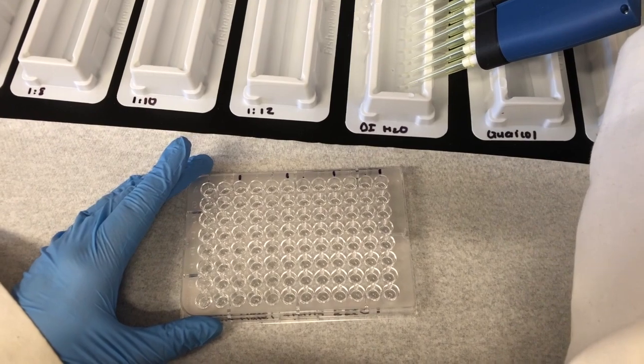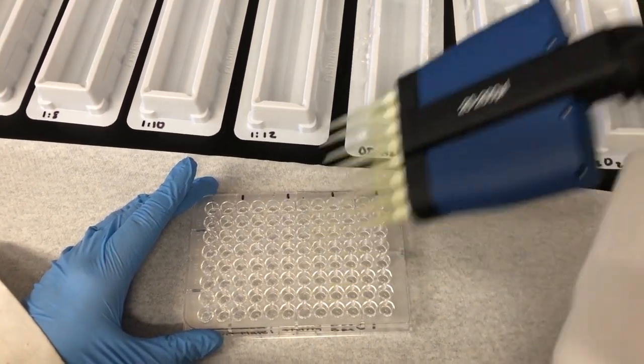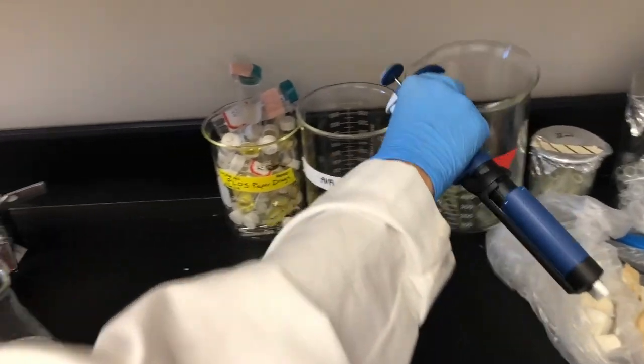Since we are dispensing the same liquid, I am not going to change tips each time. After, dispense your tips into the waste jar.